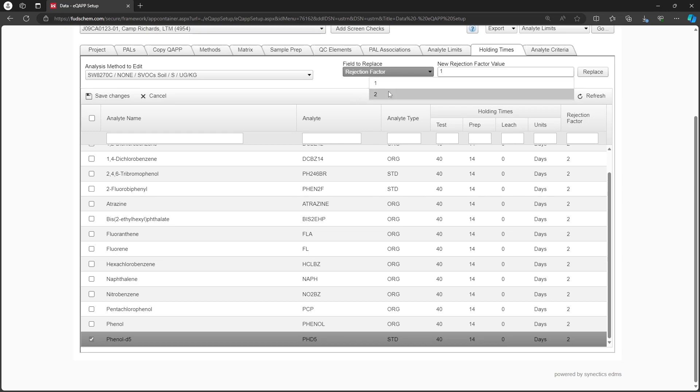Note that the gross hold times must be the same for all Analytes across all methods. Therefore, we will make sure our rejection factors match. Once we've finished editing, click Save Changes.